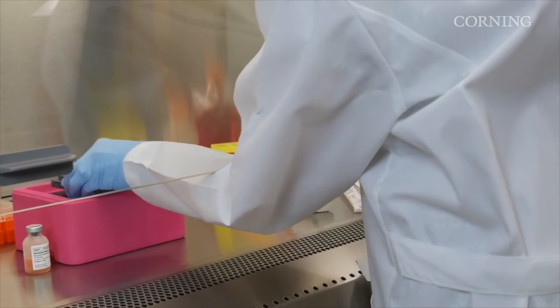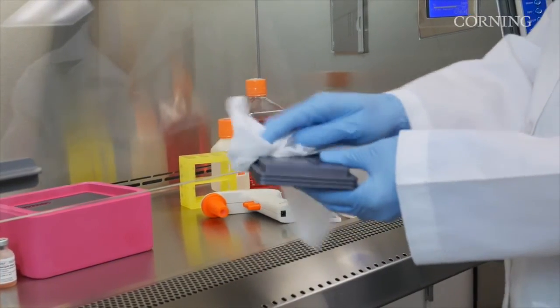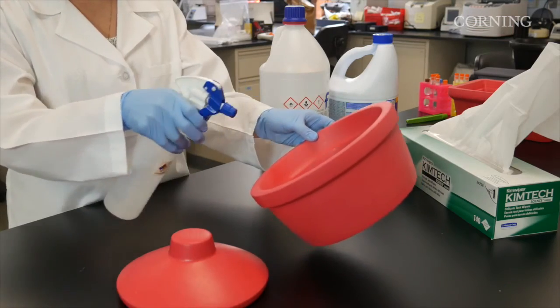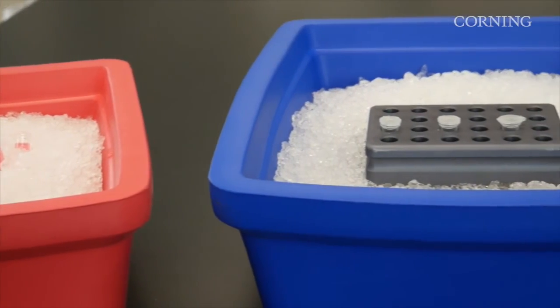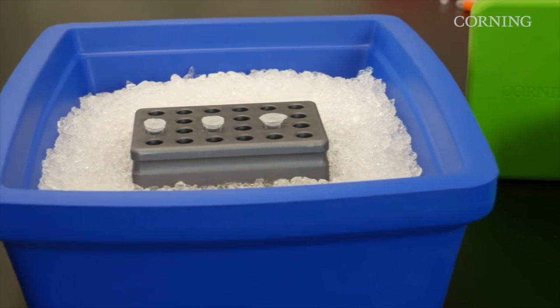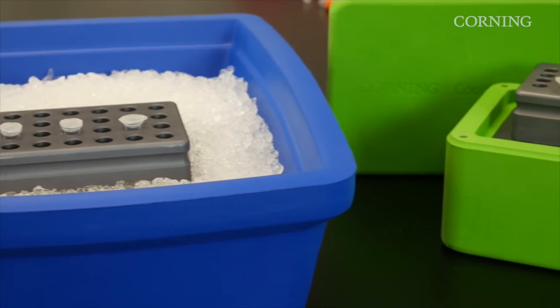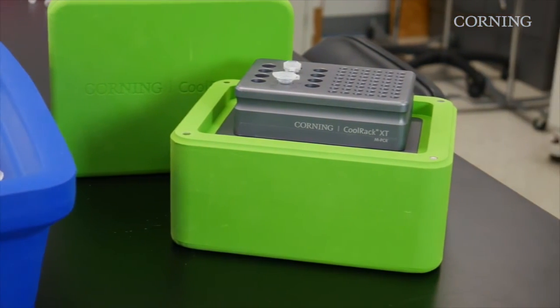All Corning CoolRack and thermal trays are easy to clean and are reusable. They may be autoclaved or cleaned with alcohol or common lab detergents. Reduce variability and increase consistency and reproducibility by choosing a good, better, or best sample handling option from Corning. You'll enjoy the benefits of cool and stable samples while you work. To learn more about these products and to see our comprehensive cell culture solutions, please visit corning.com/lifesciences.